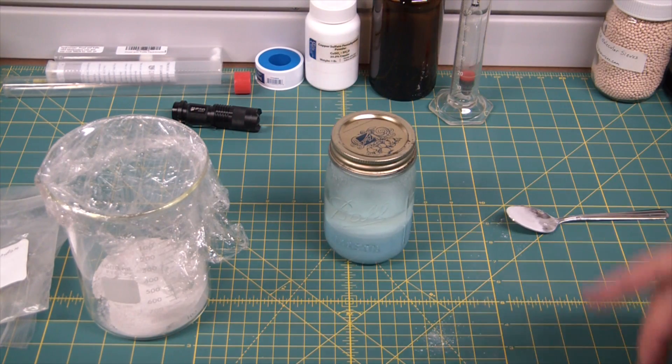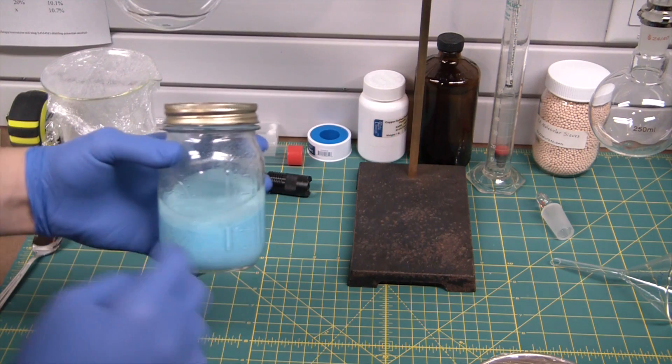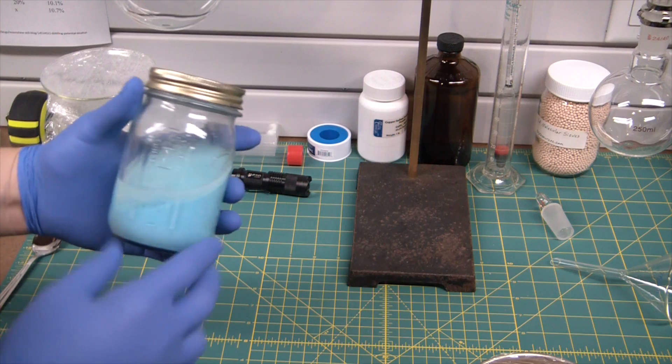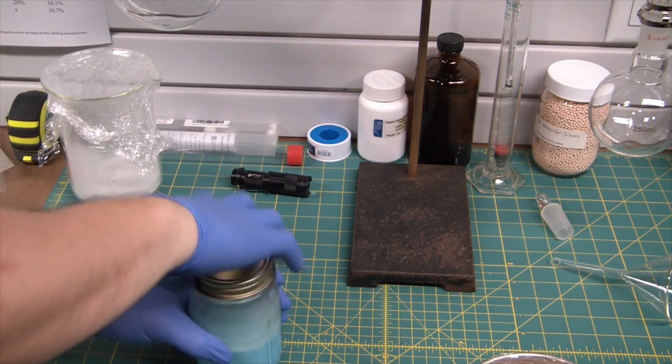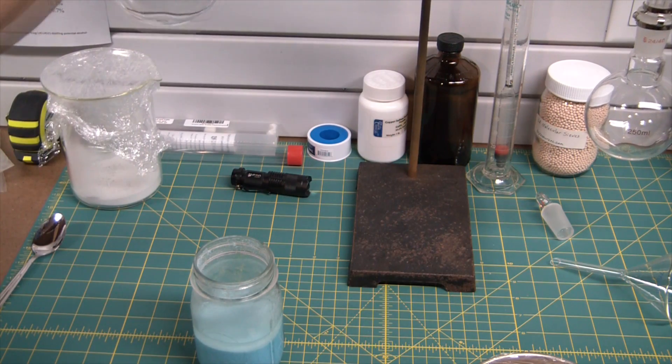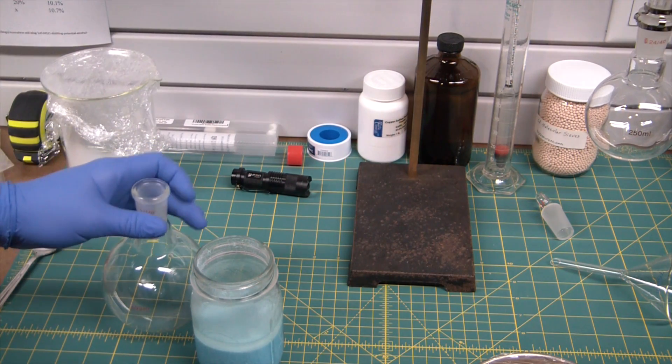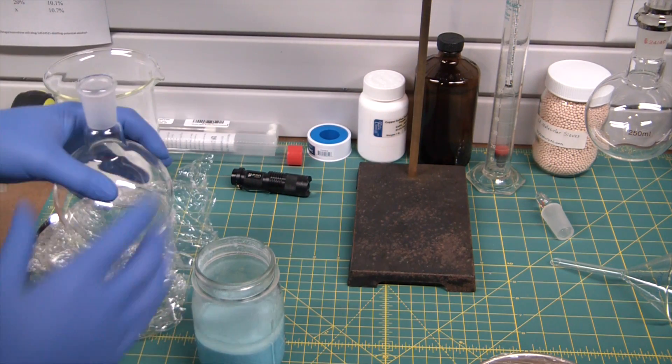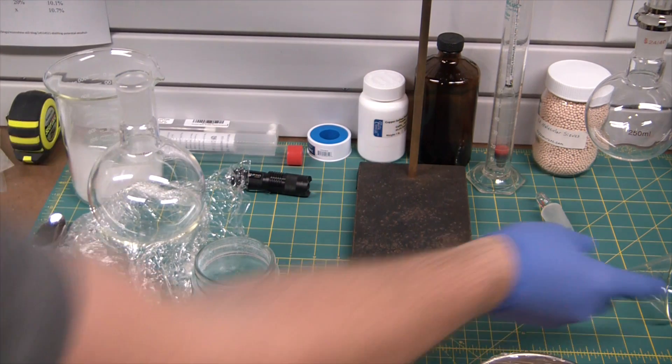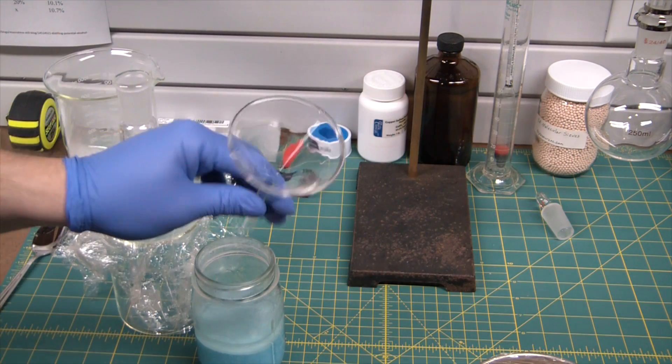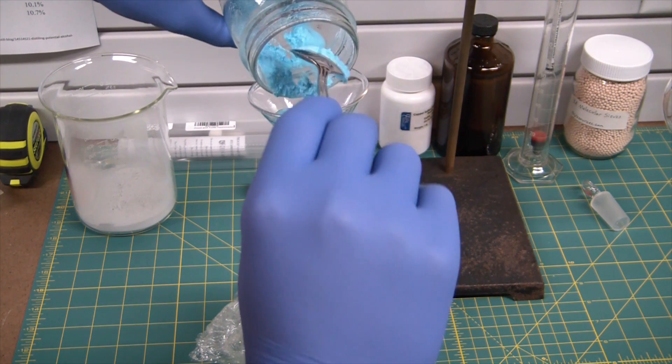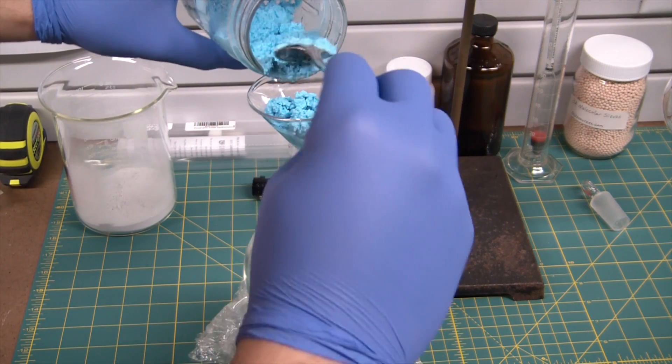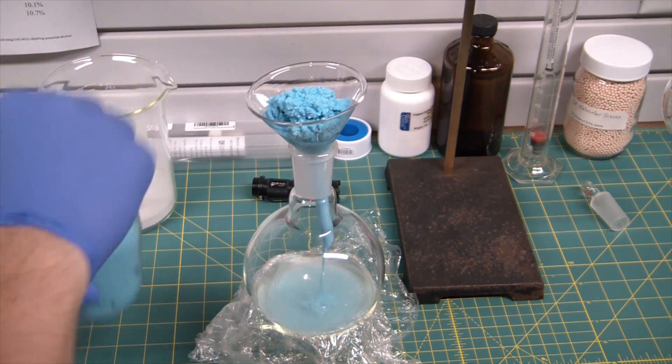All right, so it's been about 24 hours since I added the anhydrous copper sulfate to the ethanol-water mixture, and now I'm going to add that to a 500 milliliter round bottom flask. Use a little saran wrap there, that way it sticks nicely, won't move on us. I should have a bigger funnel. So a lot of the ethanol is also going to be trapped between the copper sulfate particles, so I'm going to have to kind of force them down into the funnel.